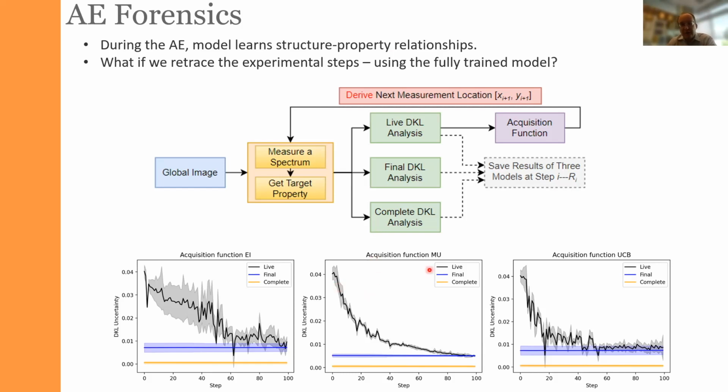So let's assume that we run the deep kernel learning-based workflow several times. One time, we run it using the acquisition function which is maximum uncertainty. So in this case, it's a pure learning process. So what we are going to do is monitor the prediction uncertainty, and we are going to average it for all the image patches, and calculate the average and dispersion.